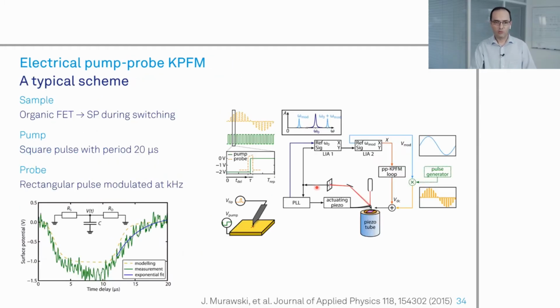So let's see one example of a pump-probe approach. Here we have a KPFM system, and there is a pump-probe method integrated with this. For details of this experiment, you can look at this nice paper from the group of Lukas Eng from Germany. What they did was measure the temporal response of an organic field effect transistor when switching the sample on and off. They measure the surface potential versus time when they switch on and off the sample, and by measuring this, they can model it with some circuit elements.